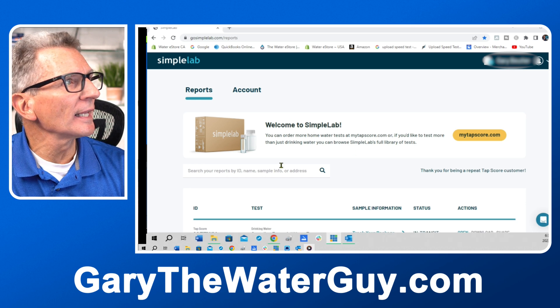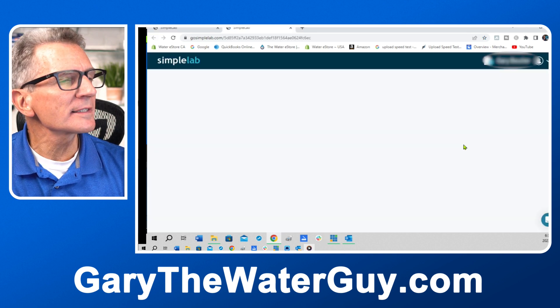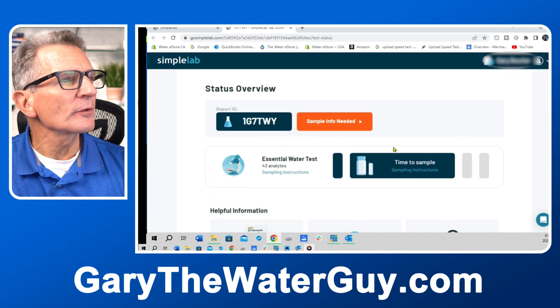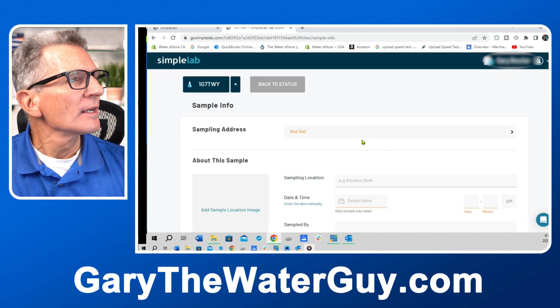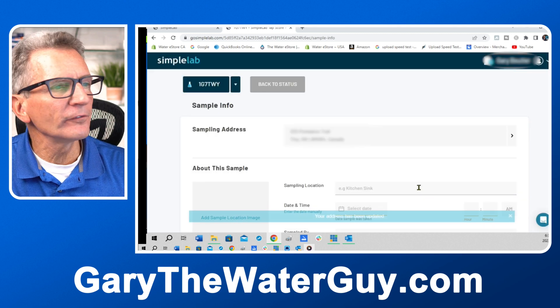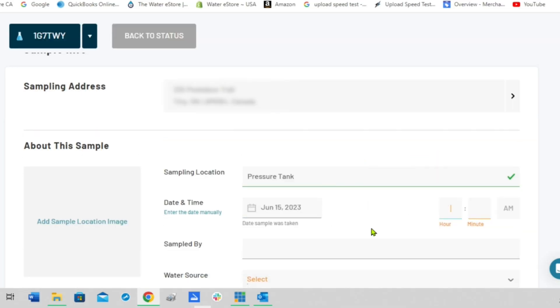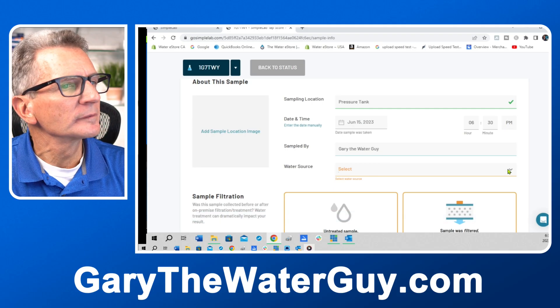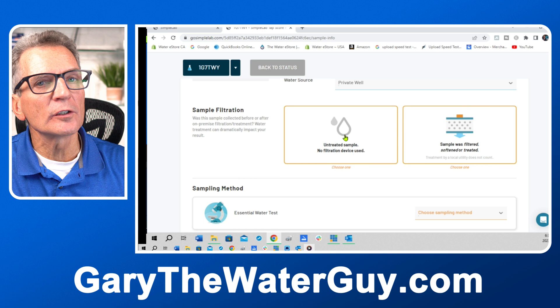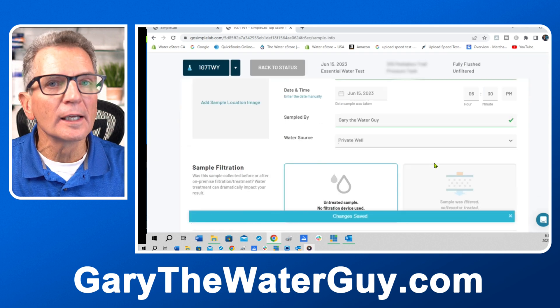Next, go to GoSimpleLab.com and log into your dashboard. For me, it's the Canadian Essential Water Test. Click on it to open it and you'll see an orange box at the top — sample info needed. Enter your sampling address (where the sampling was actually done), save that info, and enter the sampling location, meaning what part of the house you took the sample from — in my case, the pressure tank. Record who did the sampling, confirm the water source is well water, indicate that we used an untreated sample taken before the filtration system, and note that the sampling method was fully flushed.